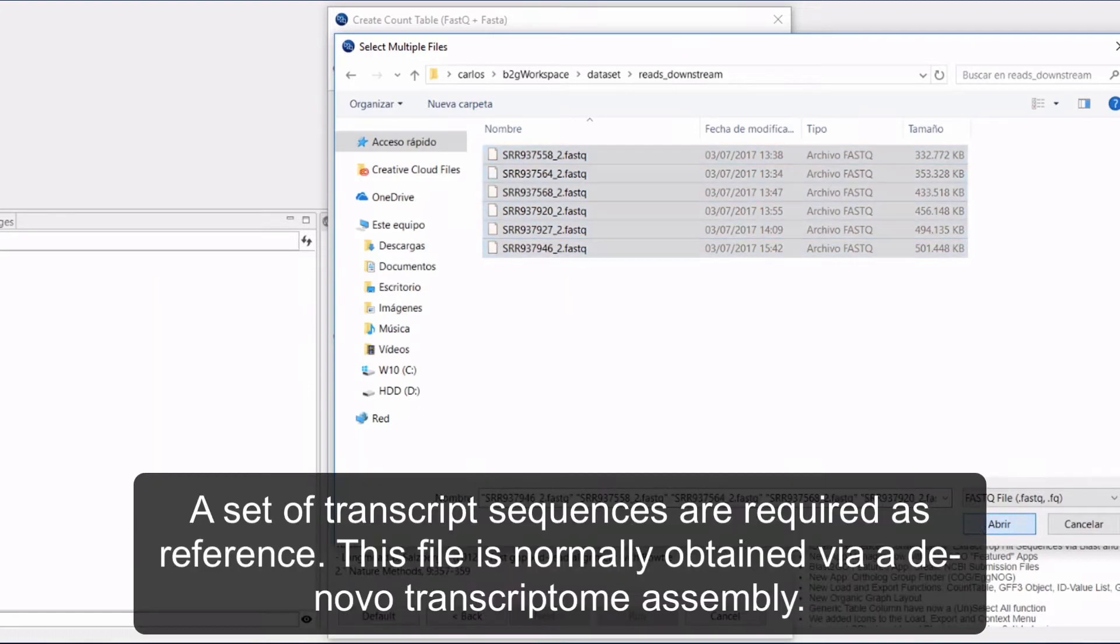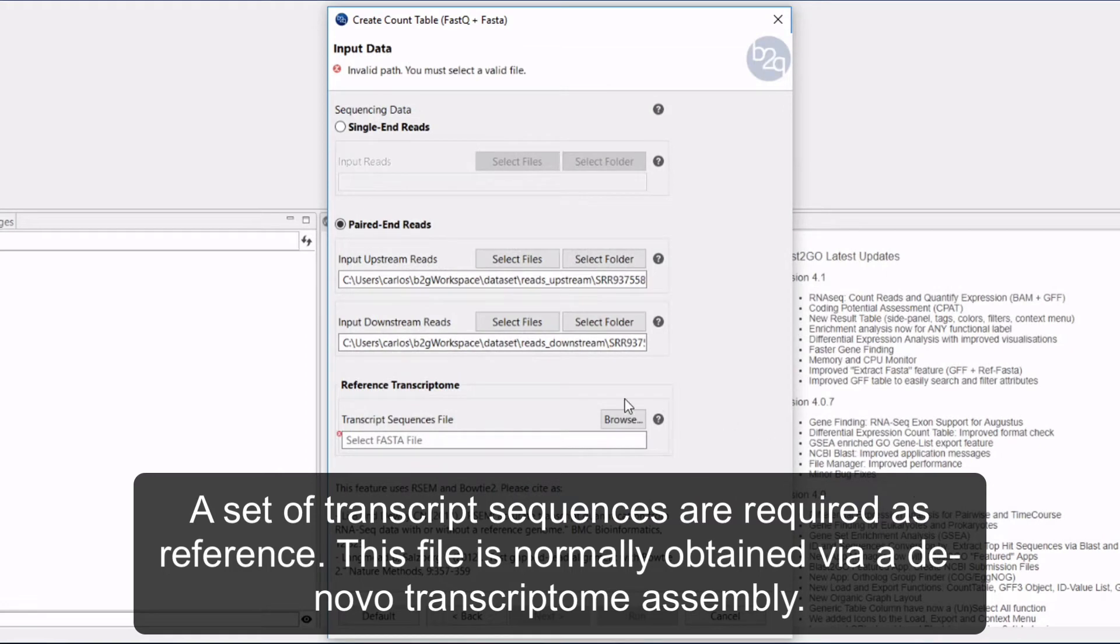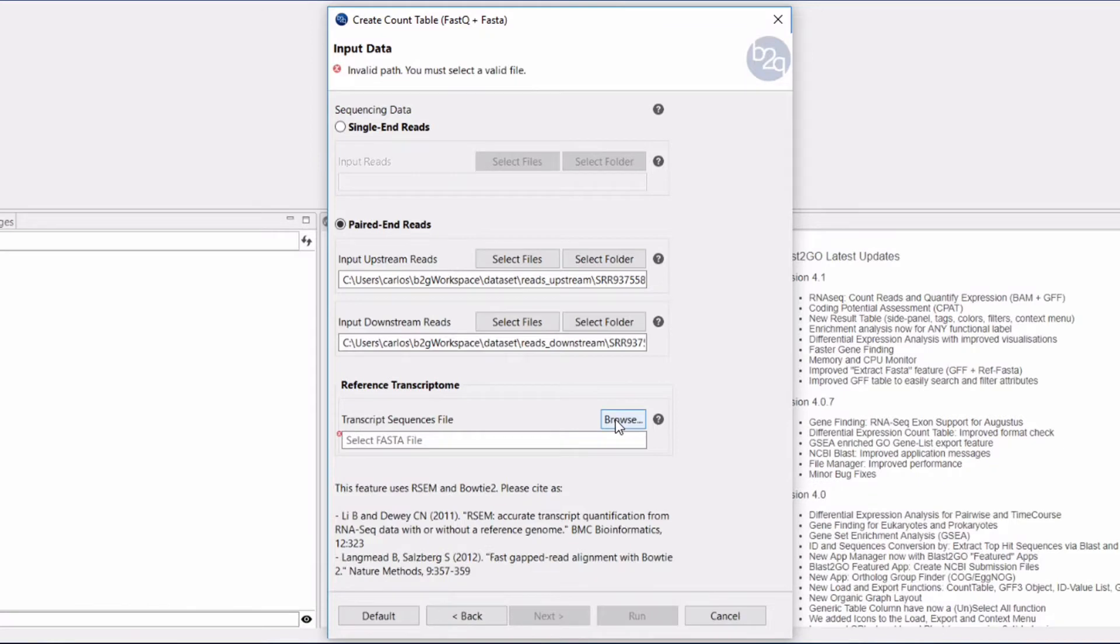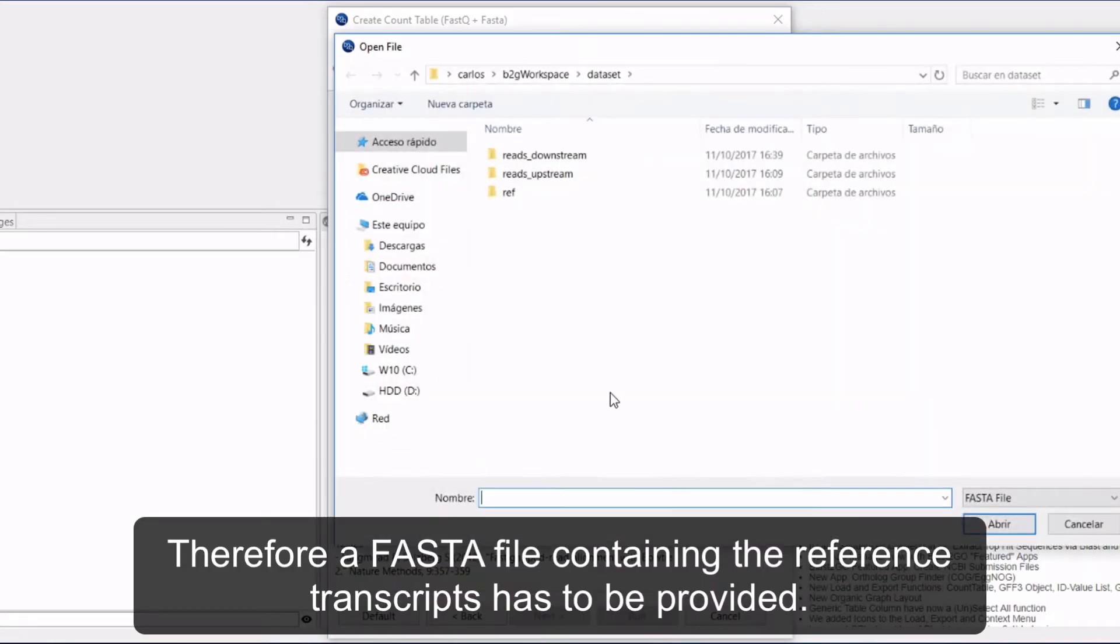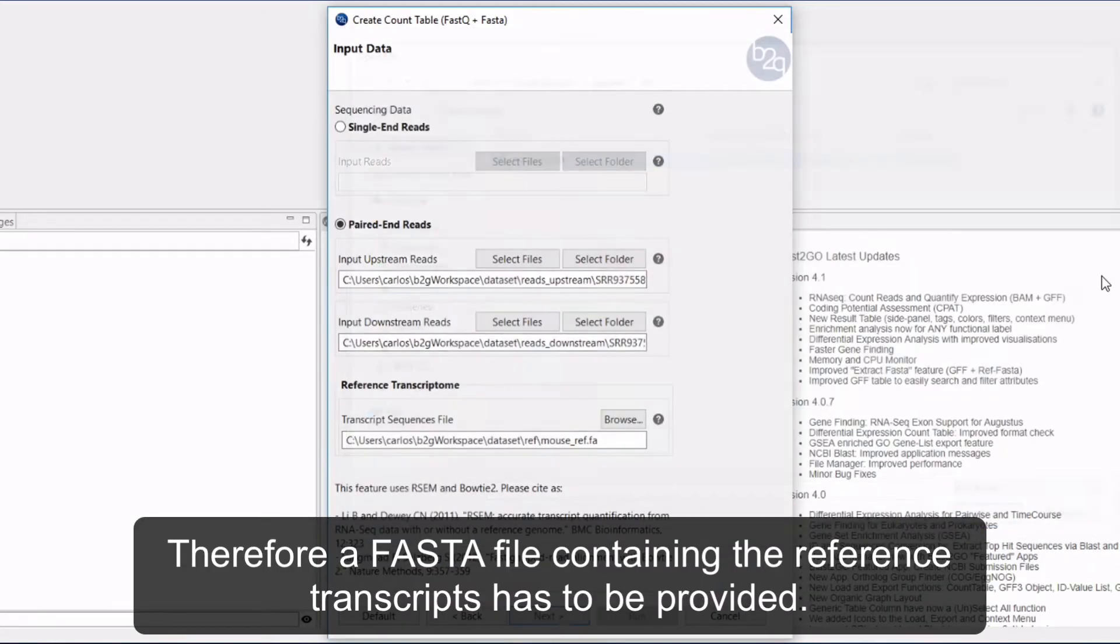A set of transcript sequences are required as a reference. This file is normally obtained via a de novo transcriptome assembly. Therefore, a FASTA file containing the reference transcripts has to be provided.